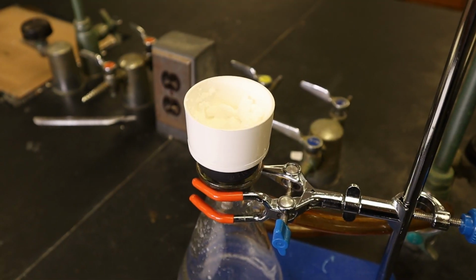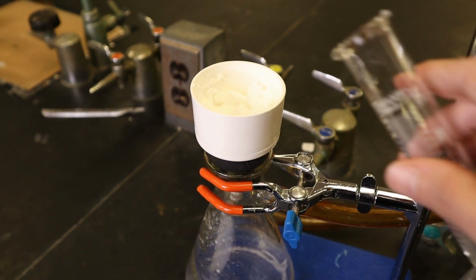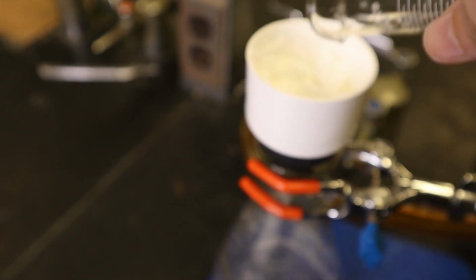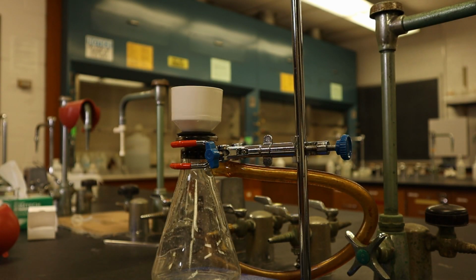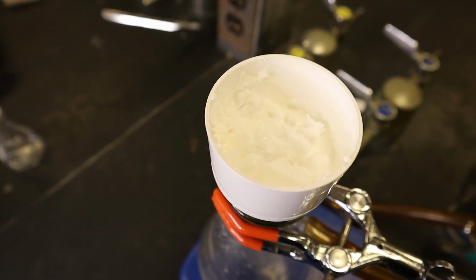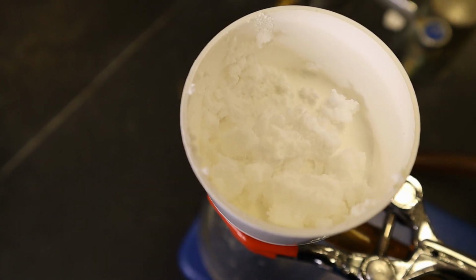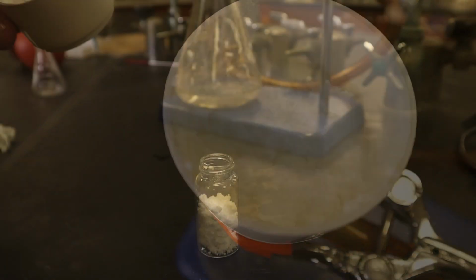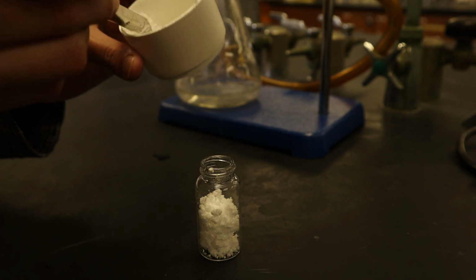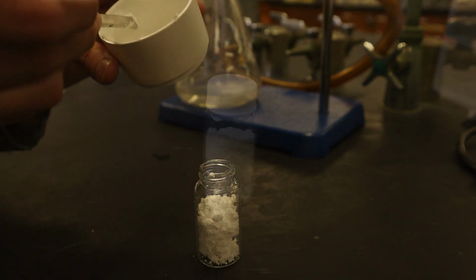Now we're going to be washing the aspirin with two 10 milliliter portions of ice cold water. Here's the first one. And here goes the second one. We added in the water to wash away any impurities, and now we're going to wait for it to dry. Now that the aspirin is dry, I'm going to go ahead and add it to the vial. Here is the finished product.